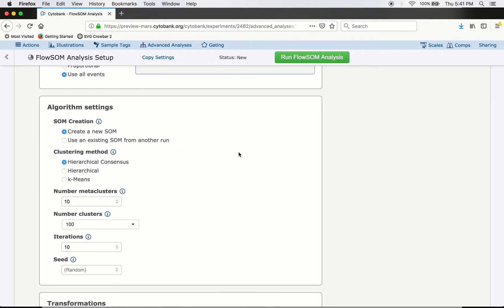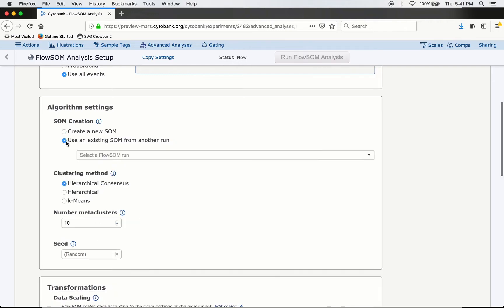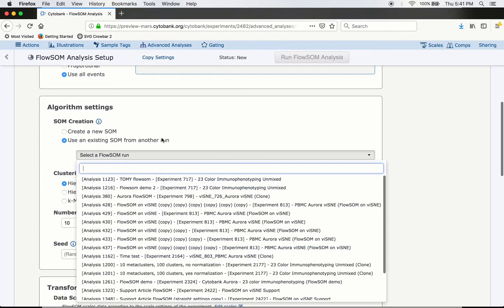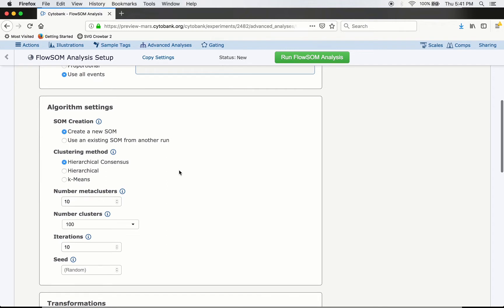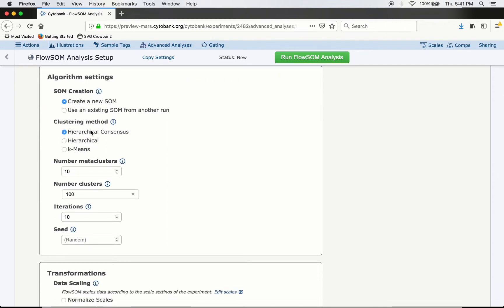This next section covers the settings to tweak the algorithm. First, do you want to create a new self-organizing map or use an existing one from a previous run? If you have previous FlowSOM runs using the same panel, you can select any of those. I'll create a new one for this tutorial. Next is the clustering method — by default we use hierarchical consensus clustering, which is robust and recommended. You can use other clustering methods if advised by a computational biologist, but hierarchical consensus is a great default.